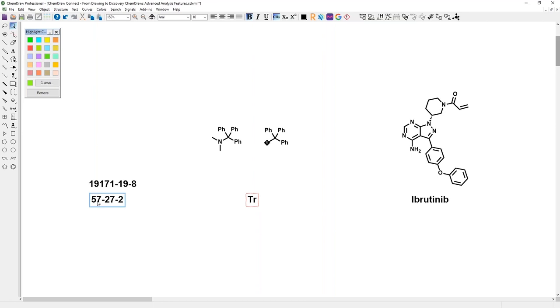do this as well in bulk, especially in Chem3D, generate 3D views of your structures to then be used for different use cases. For example, as part of your presentations, make it easier to use the structure as a way to communicate by including colorings as well, which could be highlight colors, ring fill colors, or the more traditional color by element options. Of course, not to forget about things like NMR predictions. Again, as a quick way to get some initial insight into, oh, is this really maybe my product that I've just synthesized, by comparing your measured and the predicted NMR.